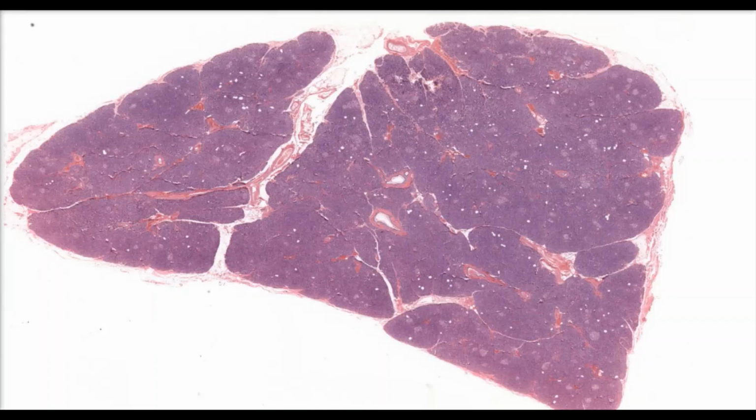The slide that we're currently looking at shows the pancreas. One important thing to note is that the pancreas is both an endocrine and an exocrine gland. The exocrine portion stains darker and is involved in the production of digestive enzymes. The endocrine portion stains lighter and forms these somewhat circular regions called pancreatic islets or islets of Langerhans.